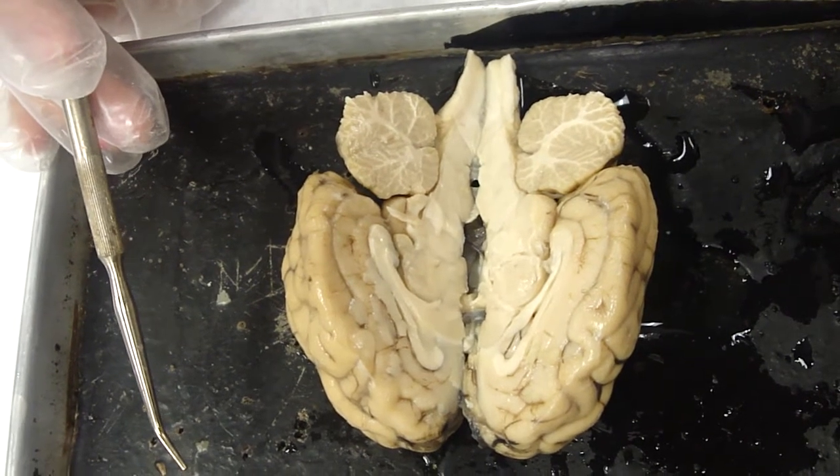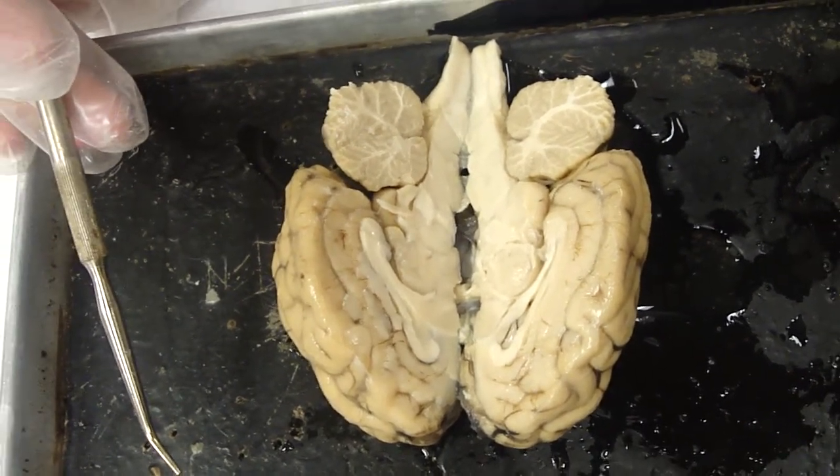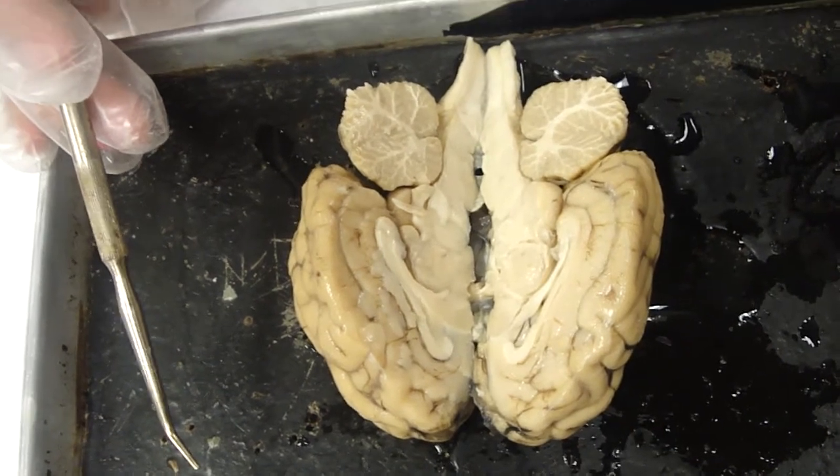I've got a brain here that we have already opened, and we'll take a look at the insides of this. So we're looking at the inferior view right now. Let's turn it back over to the superior view. It'll fall in half like this when you've made your cut.